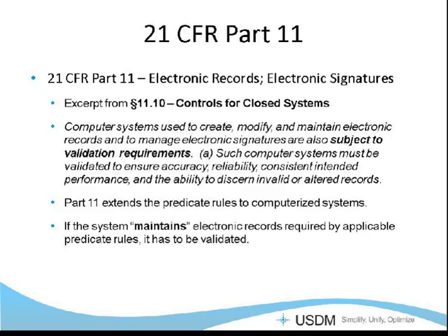So what Part 11 does is extend the predicate rules, the good laboratory practices, good manufacturing practices, and good clinical practices, under the CFR to electronic systems. So if you maintain any electronic record that's required by the predicate rule, then you must validate the system that generates that record.